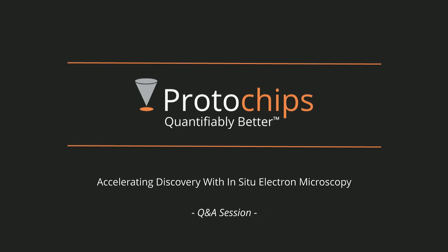Yeah, so Ray actually went over some of that in his presentation. There's a lot of different ways to look at the temperature. All of our E-chips are calibrated with the optical pyrometer, so it's a sort of thermal map of each chip before it gets shipped out. And that optical pyrometry is used to create a unique calibration file for each chip.